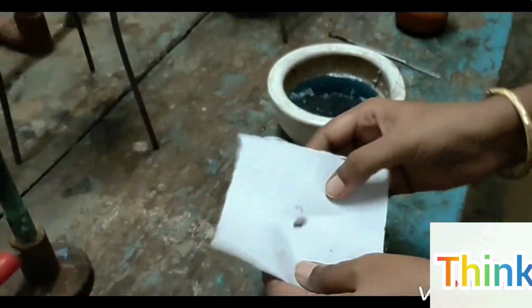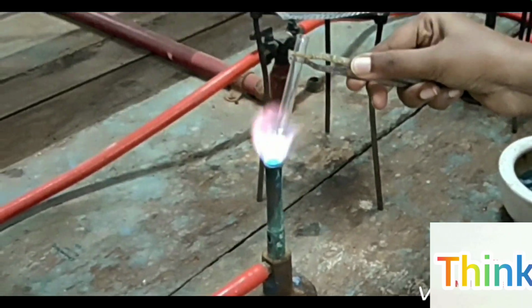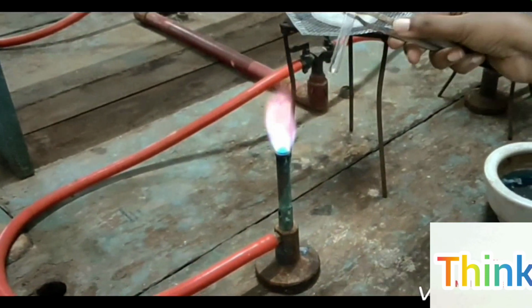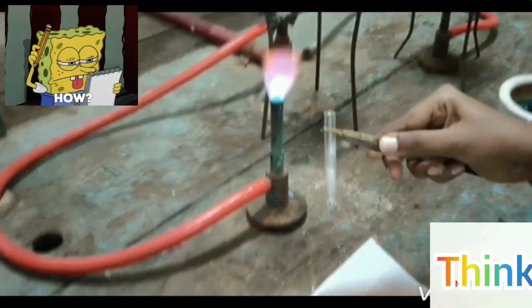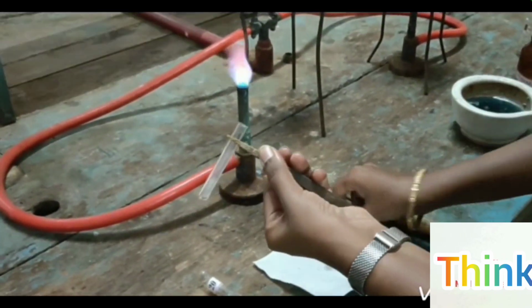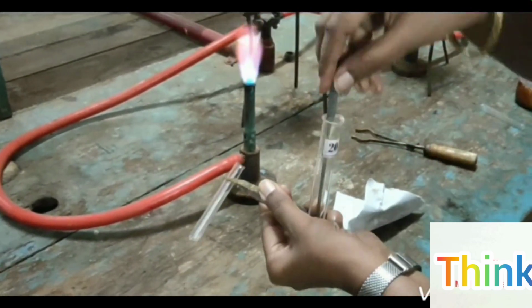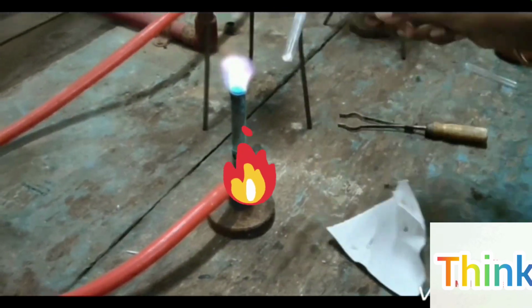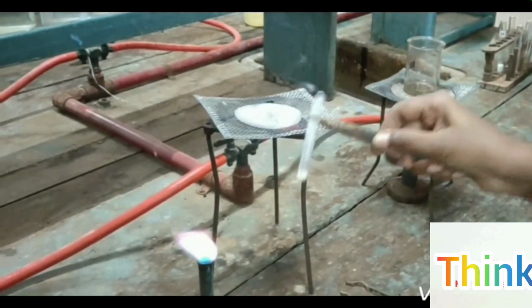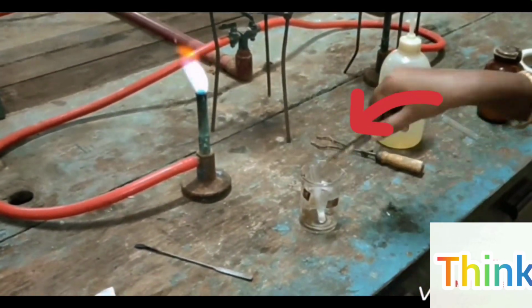I take a small pinch of sodium metal out from kerosene, since it gets easily oxidized, so we have to handle it very carefully. And then I introduce it into the Bunsen flame. Now you can see the sodium metal melts to a shining globule, and then I am going to add a small pinch of organic compound into it. What happens? The sodium metal will fuse with the organic compound, which will form sodium cyanide.